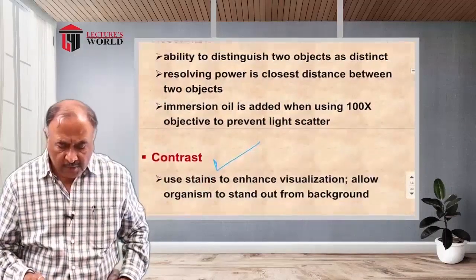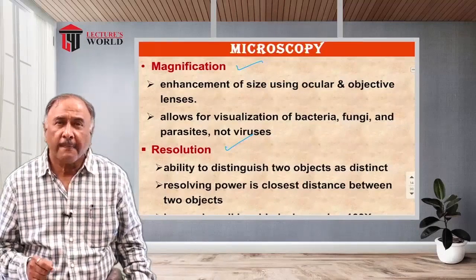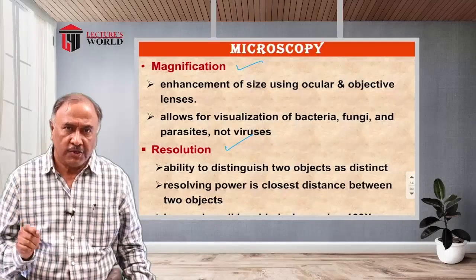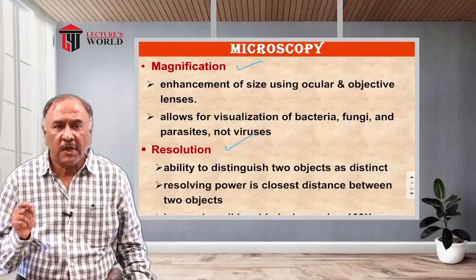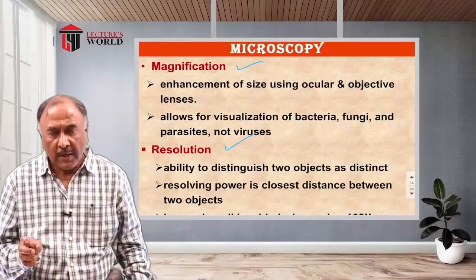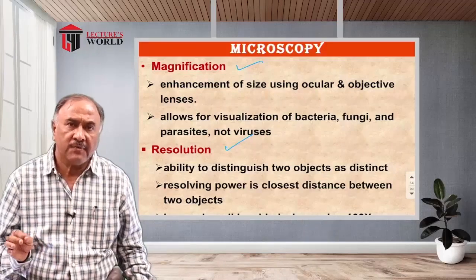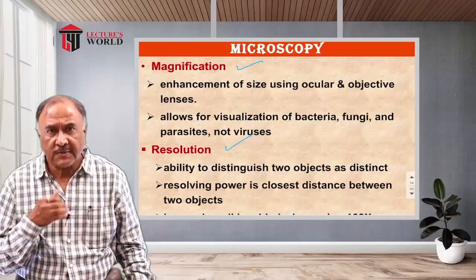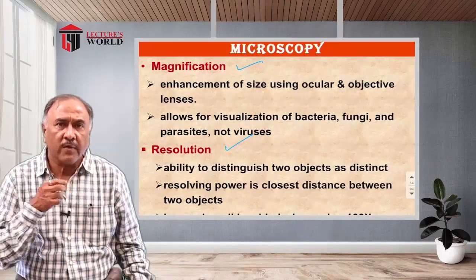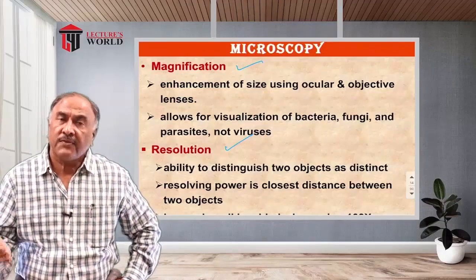Microscopic identification basically leads to primary knowledge of which kinds of organisms are present in the sample. Be careful that we have still not separated or isolated the organisms; what we are observing here is the microscopic observation of the specimen.